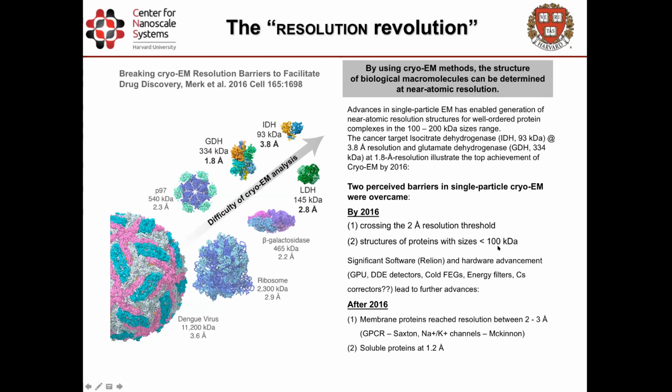Both of these are still relevant today. Actually, 2 weeks ago, we had a real breakthrough, which is now producing numerous, very fast sub-2 angstrom structures for many proteins.